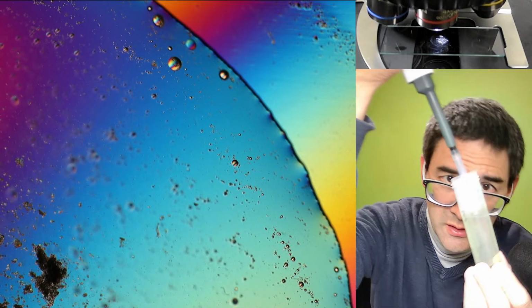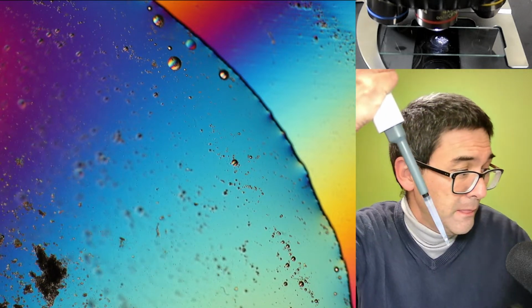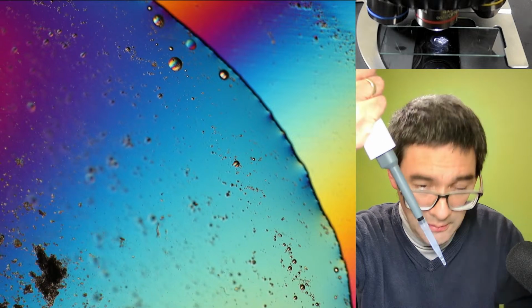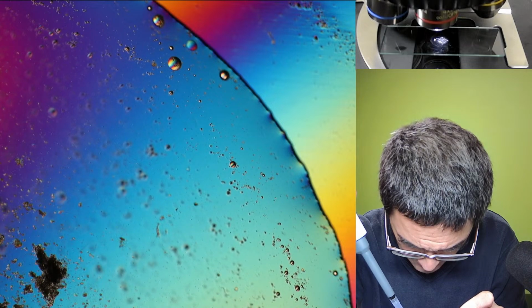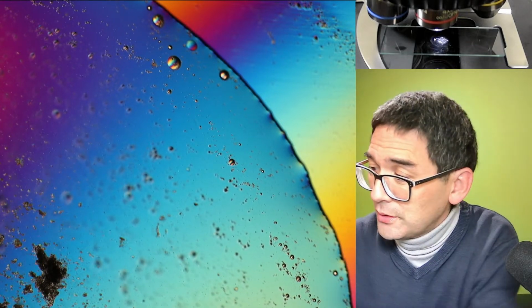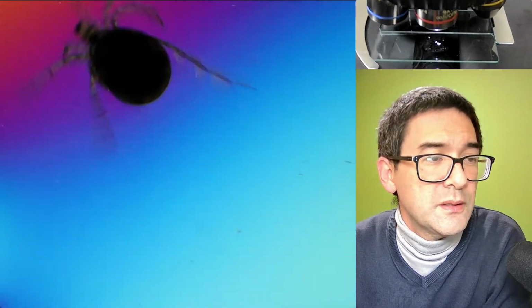What's this one? Oh, I don't know. This is a huge one. I don't know what that is. This is a huge one. Let's just have a look. Okay. So let's just do it up. I have no idea. Okay. This seems to be a pretty large one, and let's have a look what it is. Ooh, this looks almost like a mite.